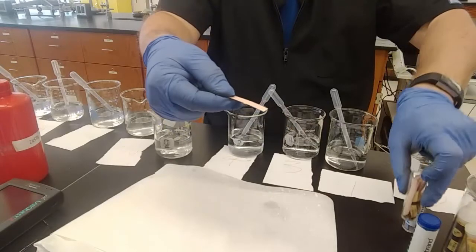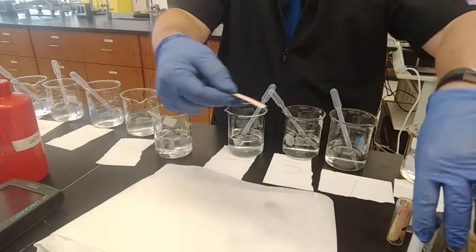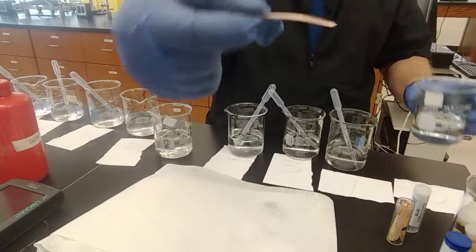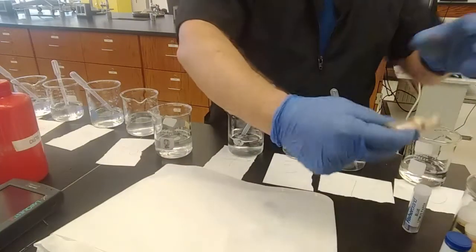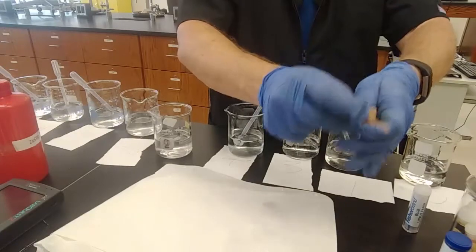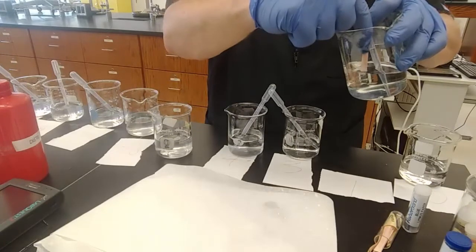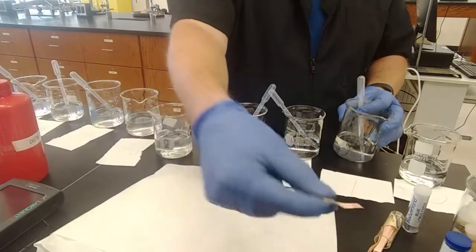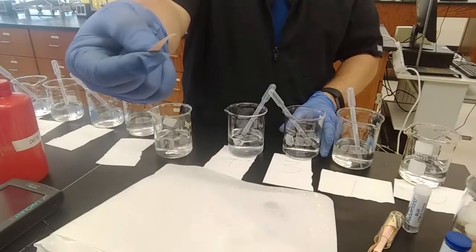All right, so let's try that. We'll start with the red litmus paper column first for all of our expected, based on our dilution, solutions. So I've got the 0 here, and I'm going to add the red litmus paper to it, and no change, as expected. It just stays red. Get a bunch of these papers out because I need 9 of them. pH 1 expected. Red litmus paper. I could just use the other end from the first one, but I'm not going to. No change, as expected. So far, so good. You know what? I will. I'll be environmentally conscious. Using the end that I haven't used before.